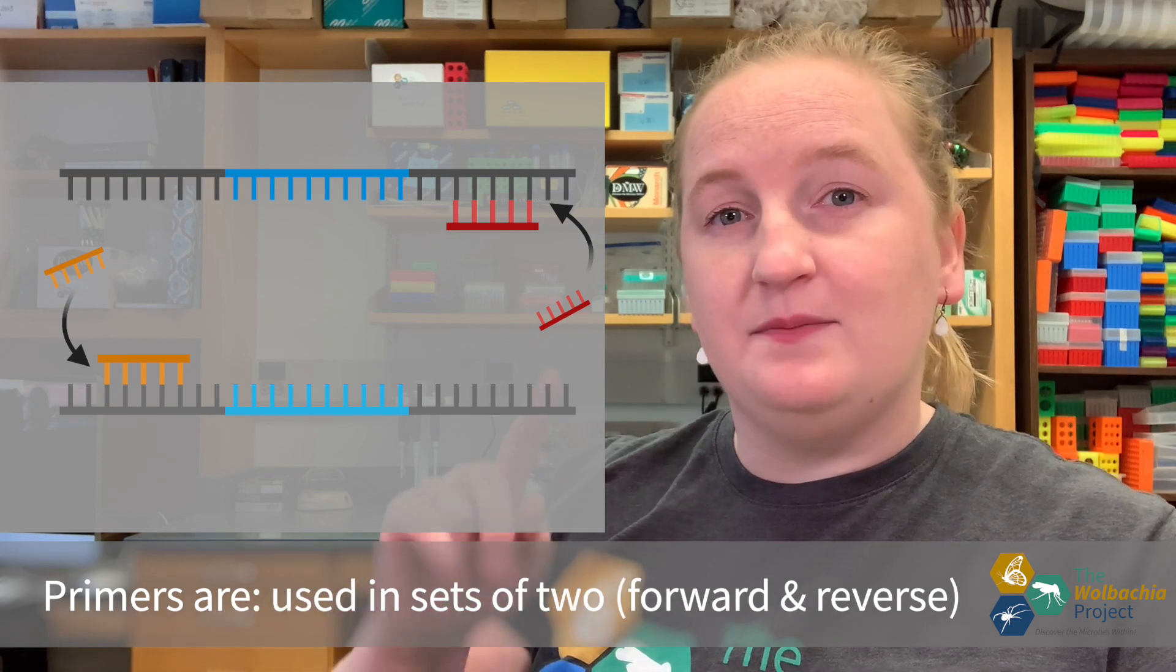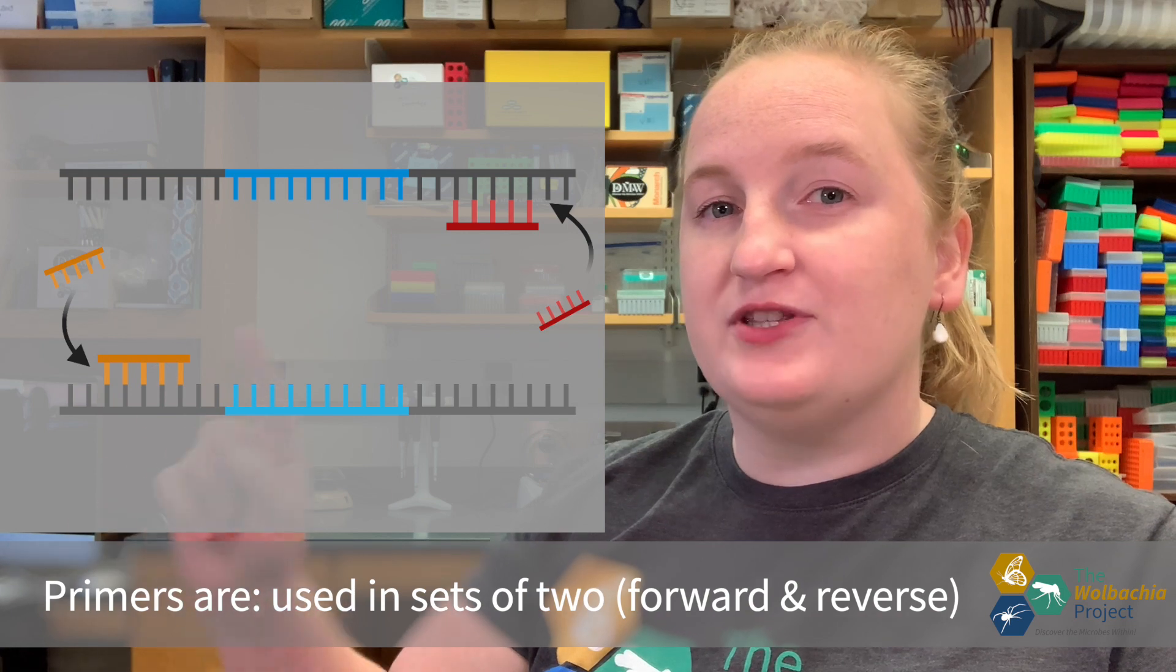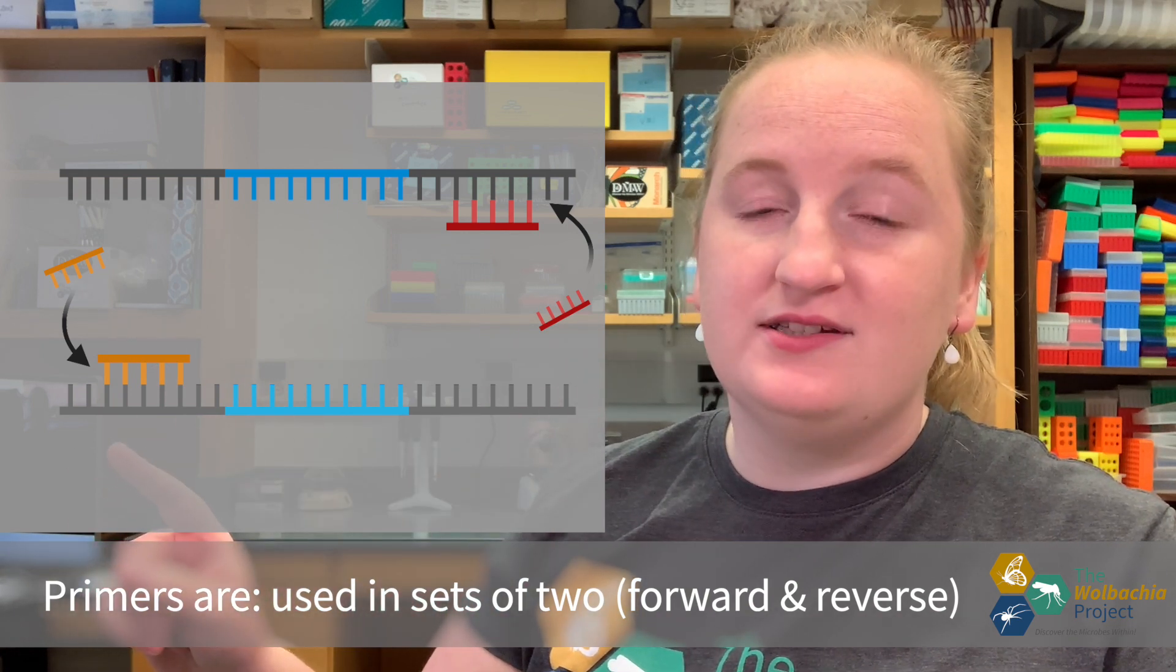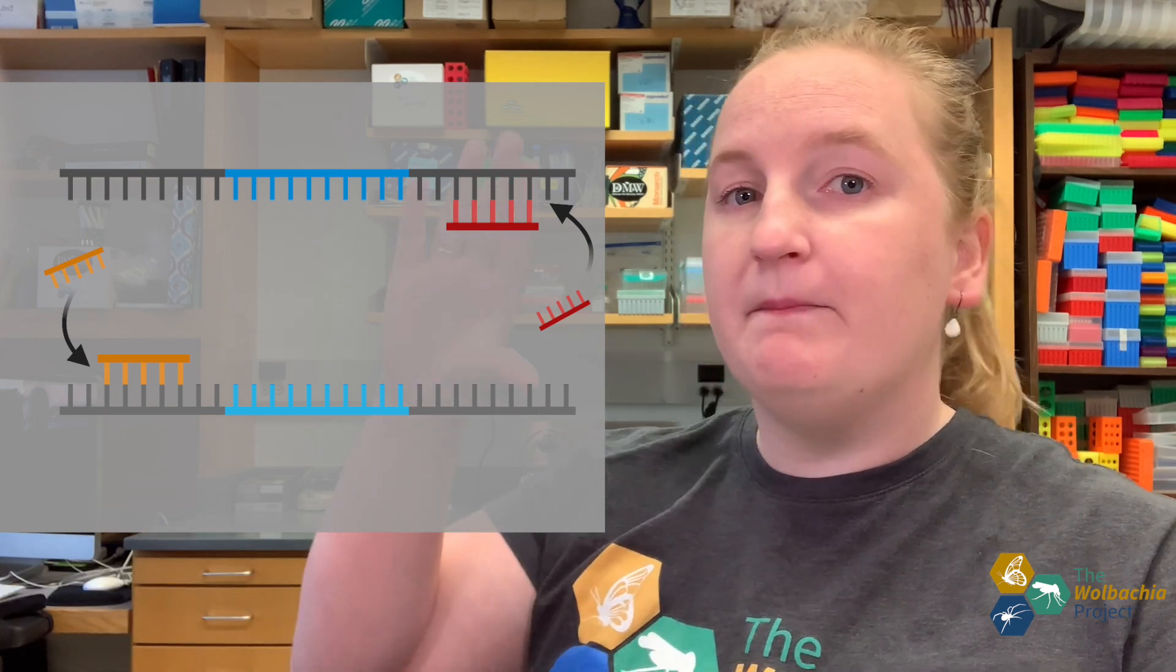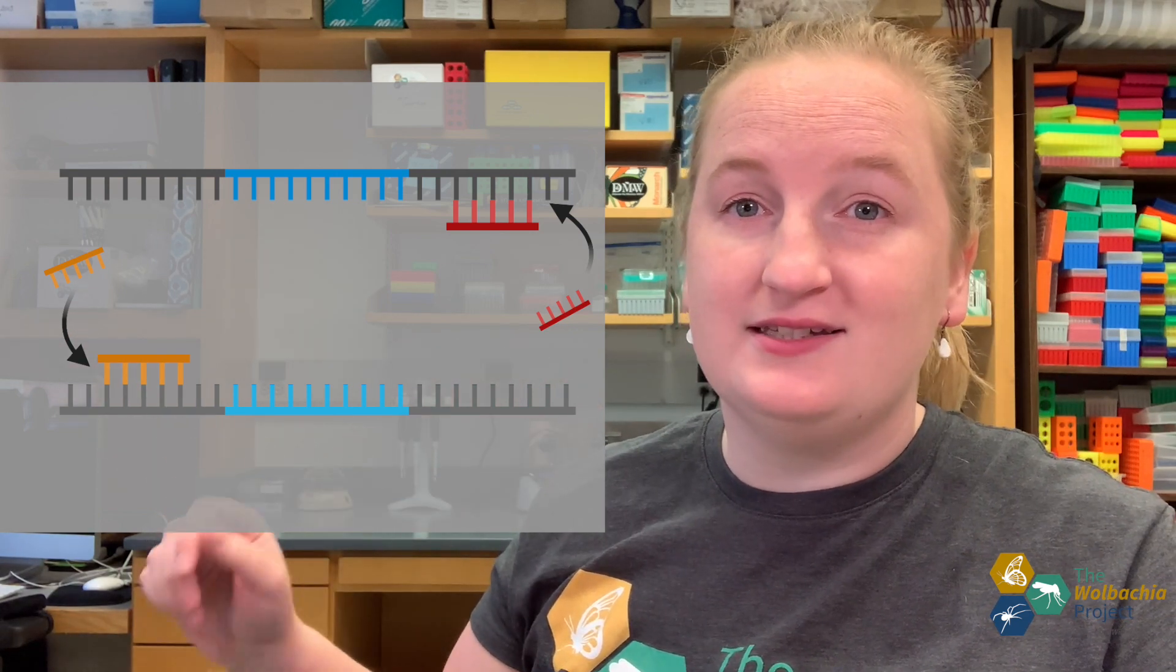We'll add primers at the beginning and end of this fragment so that we capture this entire area. These are called forward and reverse primers. Then, a special DNA polymerase that can withstand really high temperatures will bind to these primers and replicate the DNA across the entire region, adding new nucleotides. That's the general idea for one copy, but what about multiple copies? How do we amplify this exponentially?